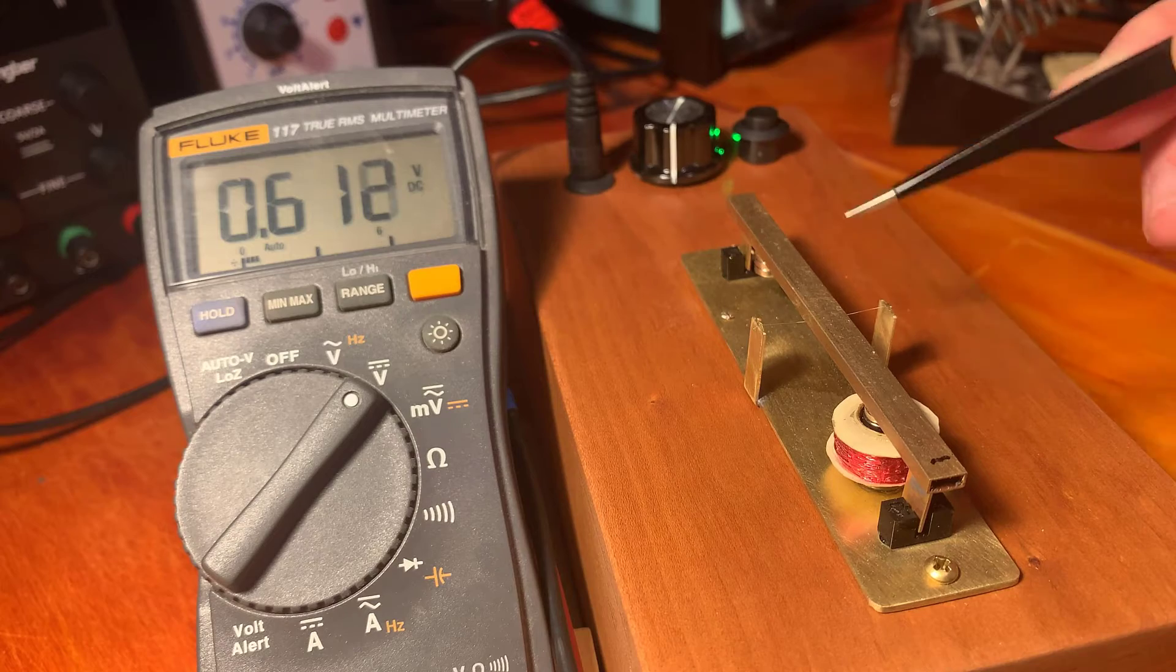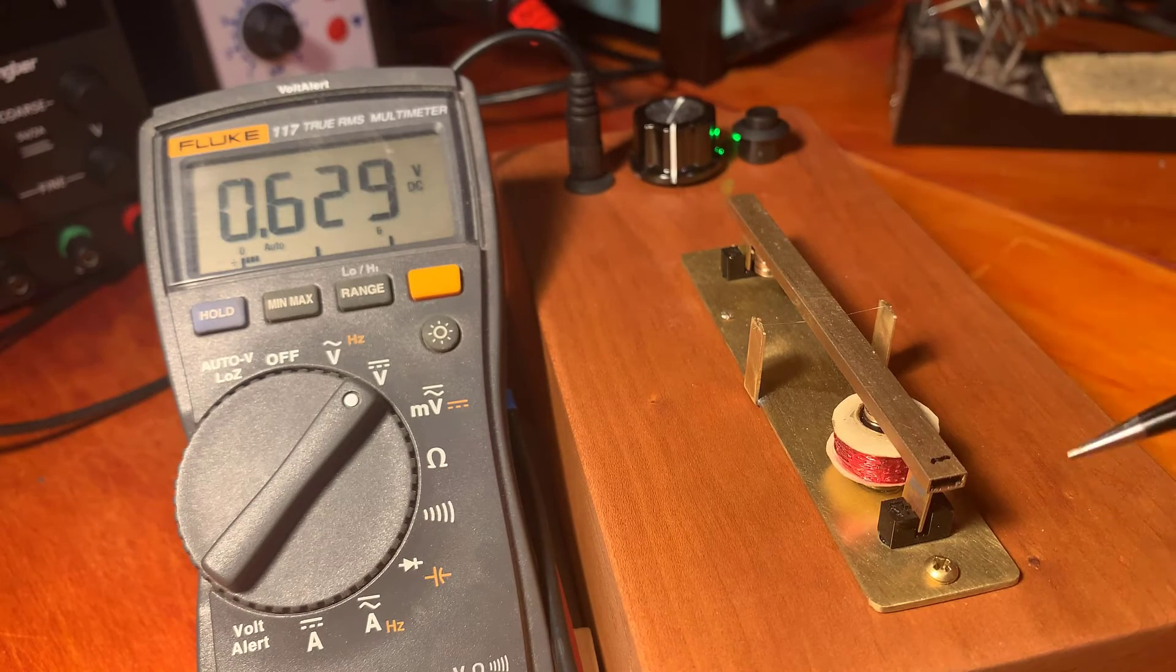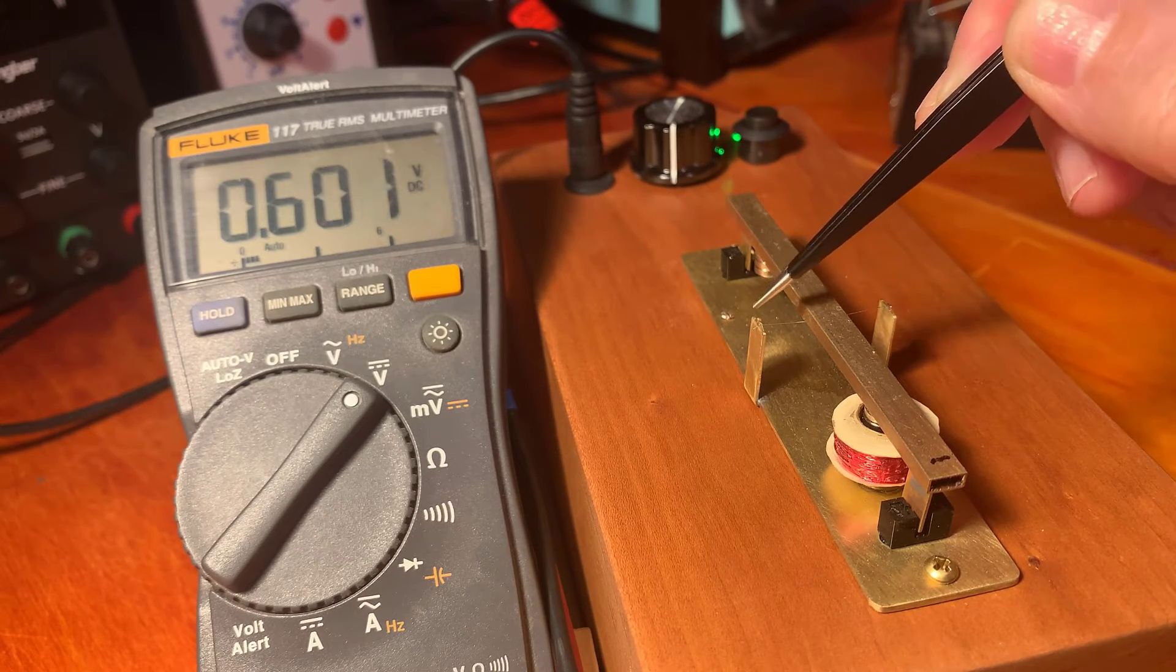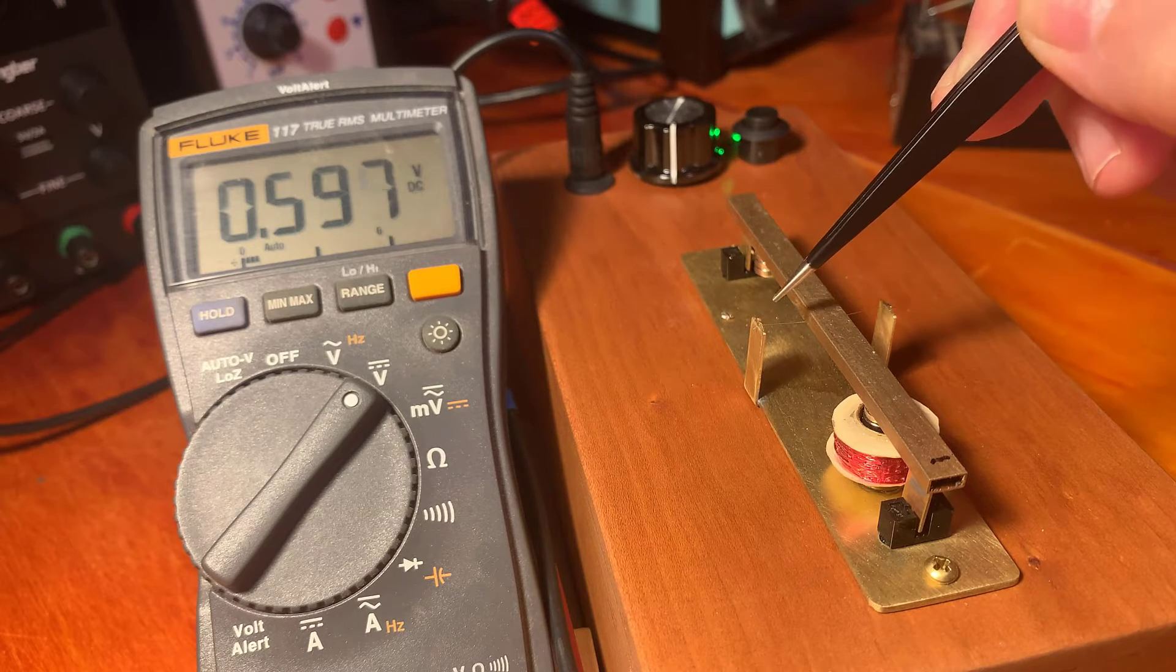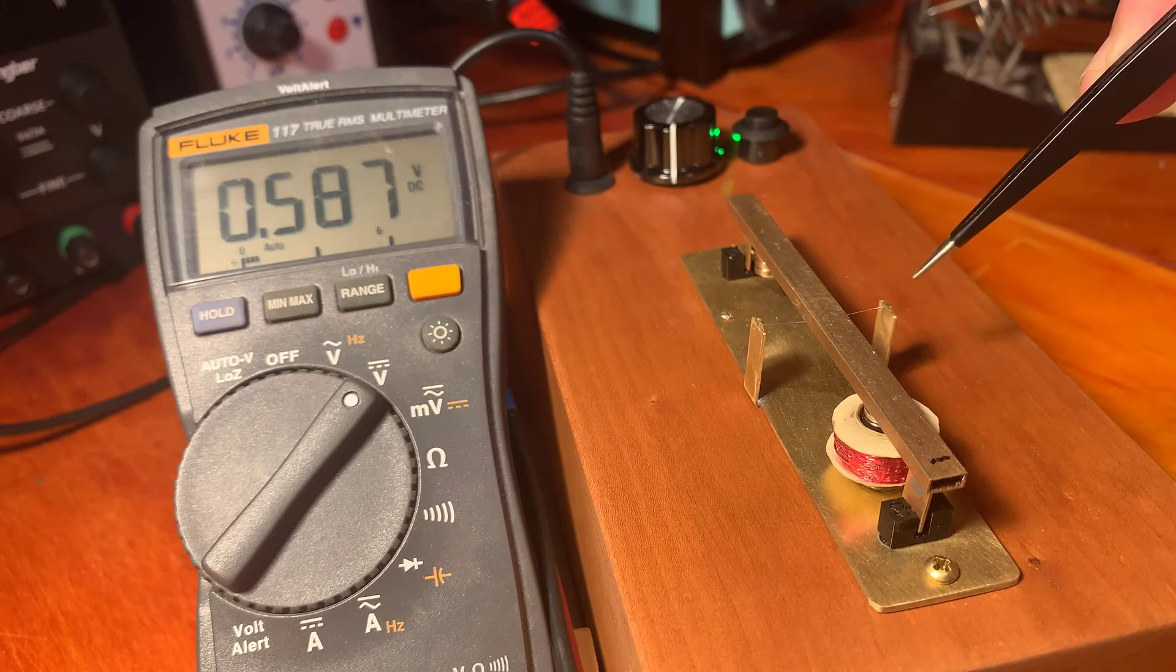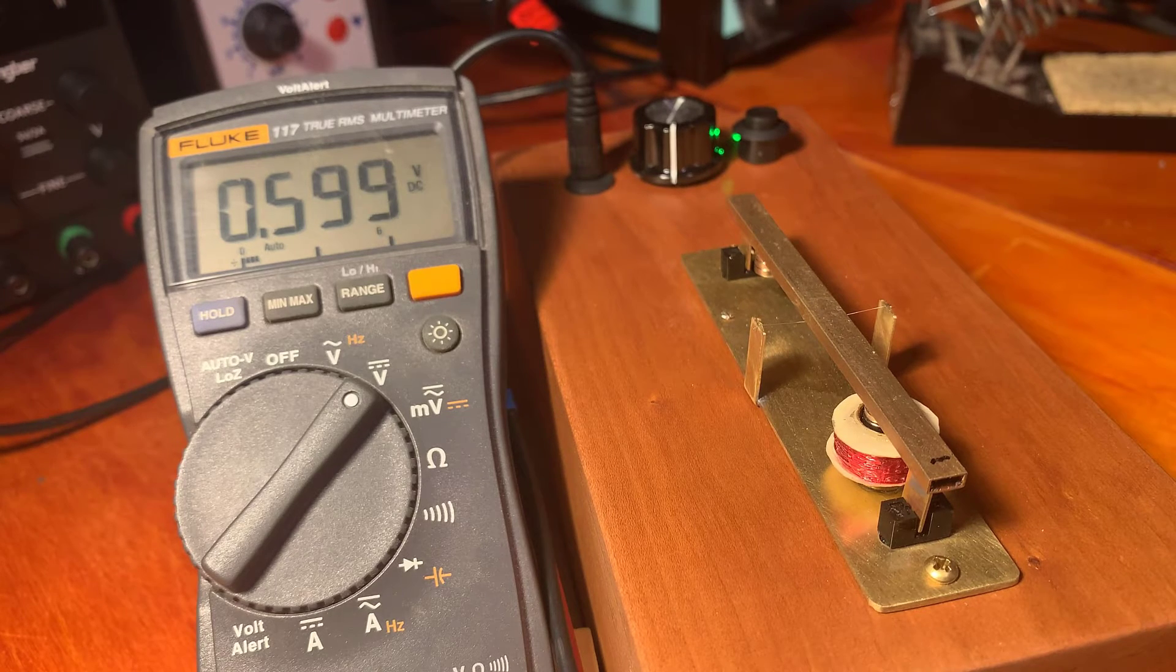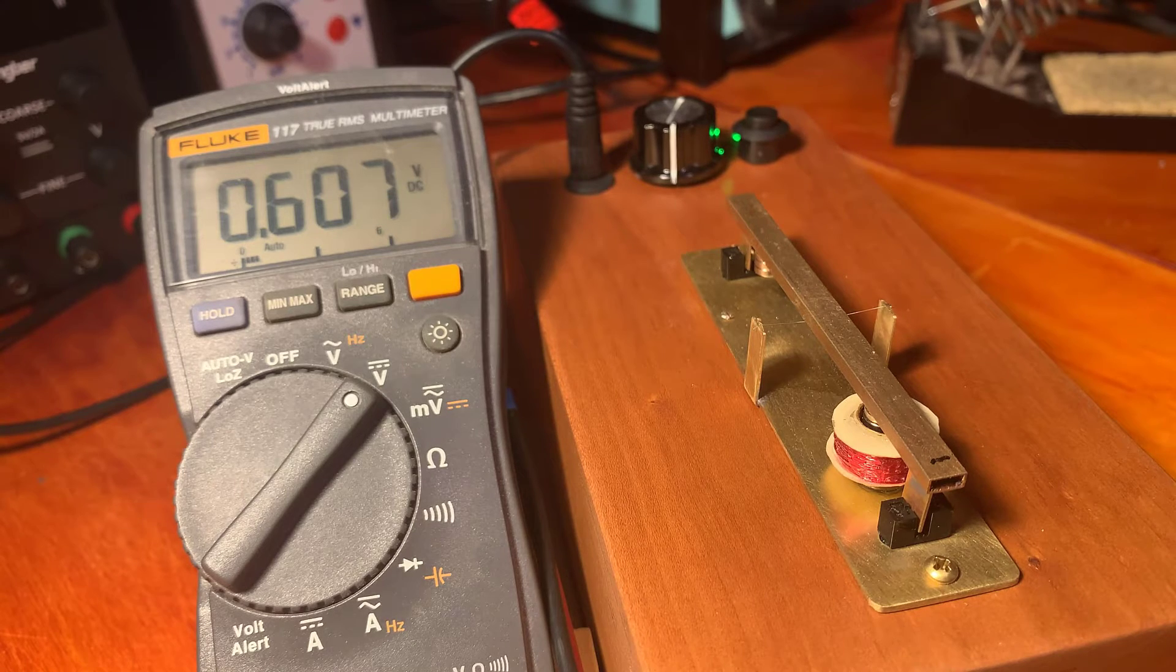There's a brass bar. It's actually just a hollow tube. And there's two support points where I've stretched a stainless steel wire. And that's the fulcrum for the balance.